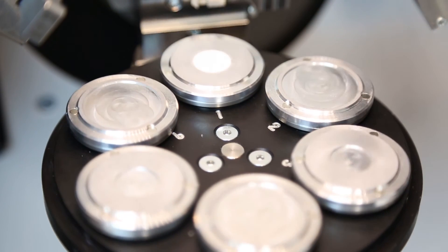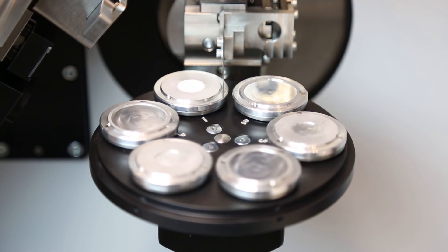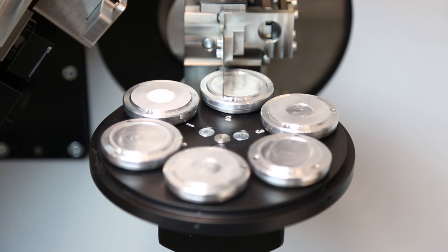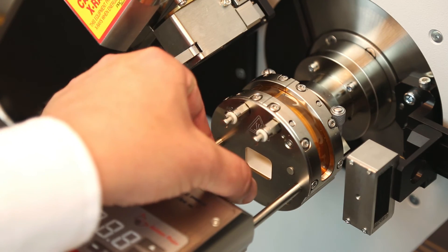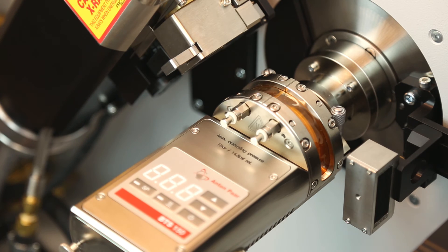A rotating sample stage is utilized for improving particle statistics of samples with preferred orientation. For high throughput laboratories, an automated six position sample changer is available which allows for unattended operation of the AX3D. For those interested in a material's thermal properties, a temperature stage can be added to heat samples up to 500 degrees Celsius in a controlled environmental chamber that can be placed under inert gas such as nitrogen or argon.